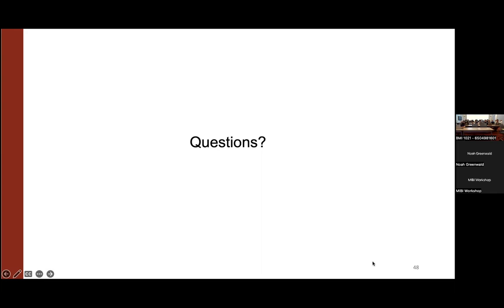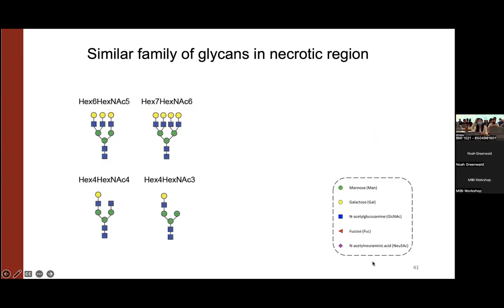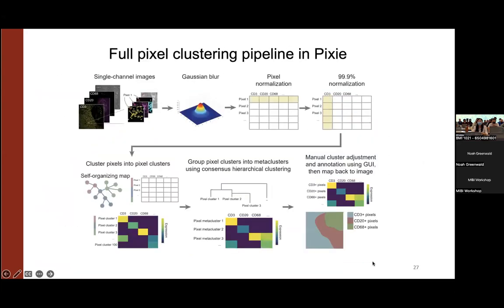How about the normalization part? Yeah, that's a good question. We first pre-normalize them. What method do you use for normalization? The max normalization? There are different ways of normalizing. Yeah, so we really do just two things. For the pixel normalization, we divide each pixel by its total, so that it is independent, and then there is a 99.9% normalization step. So we calculate those 99.9% normalization factors across the entire data set first. And that's how we normalize, those two steps. Okay, thank you. It's great work.